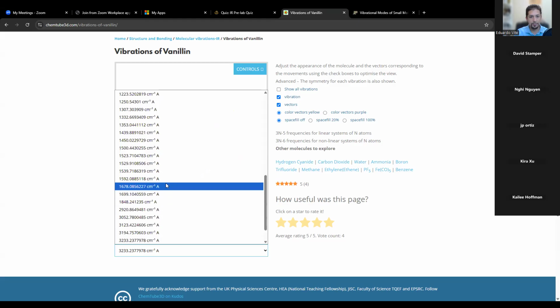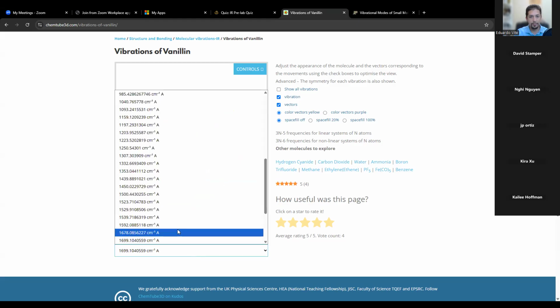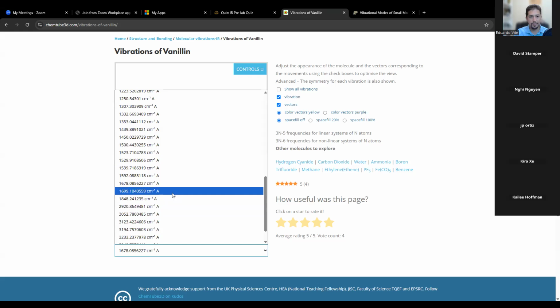That one's at 1700. 16. Let's do this one here. Nope. 1678. Nope. 1699. Nope. Oh my goodness. That ketone is not cooperating today. I think it's 18. There we go.